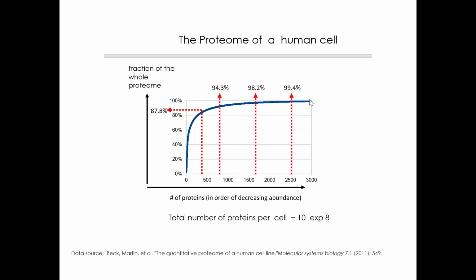Now, the argument that we would make would be that if we are interested in discovering a factor that carries out a specific function, let's say a transcription factor, and we want to see that protein, we clearly are not sufficiently covering the proteome if we cover 3,000, 4,000, 5,000 proteins, because the chance that we do not detect this protein is very high. However, if we really want to measure this protein, we would want to do very deep analysis by DDA.